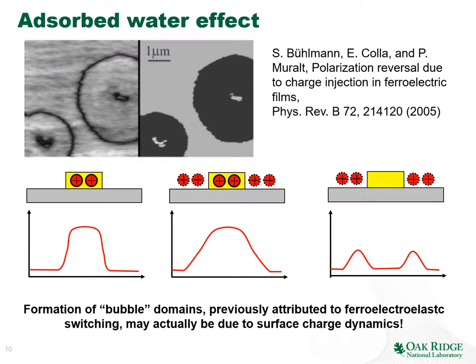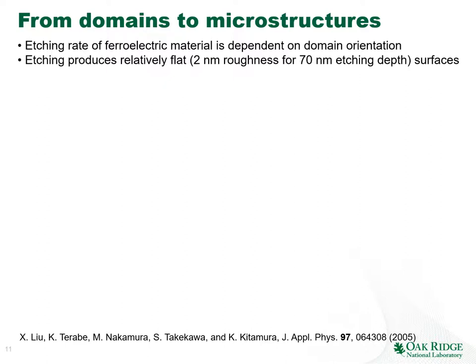It turns out that once this phenomenon was recognized, the formation of these bubble domains and the ionic effects started to be much more visible, and I will show several more examples of this behavior in the further part of the presentation. Now, if we switch domains, can we somehow translate the ferroelectric polarization into physical structures?